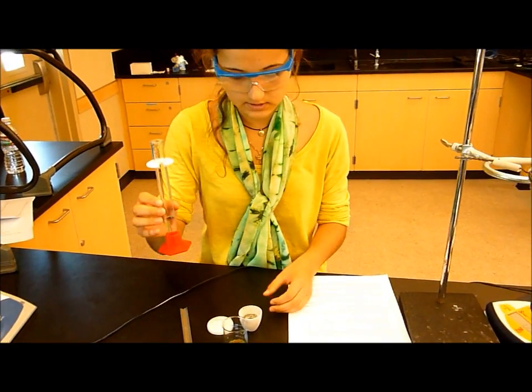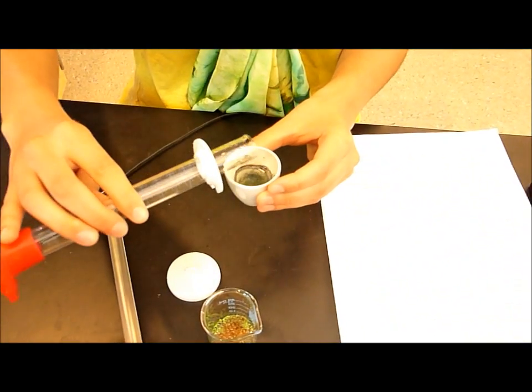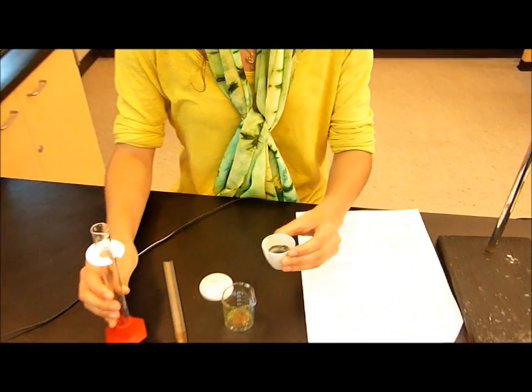Then, rinse out the crucible with eight milliliters of distilled water, and pour the water into the 50 milliliter beaker.